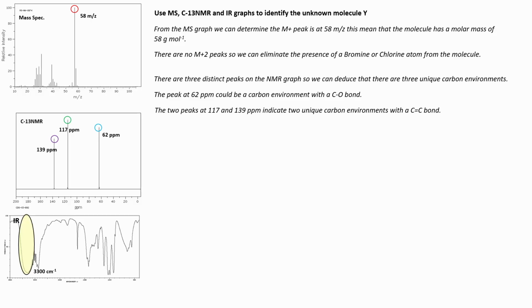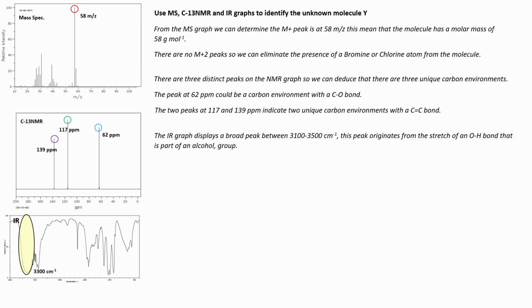So we have this broad peak here. We're going to exclude this peak just below 3000, which is caused by carbon-hydrogen stretching. But we have this broad peak here, which is between 3,100 and 3,500.